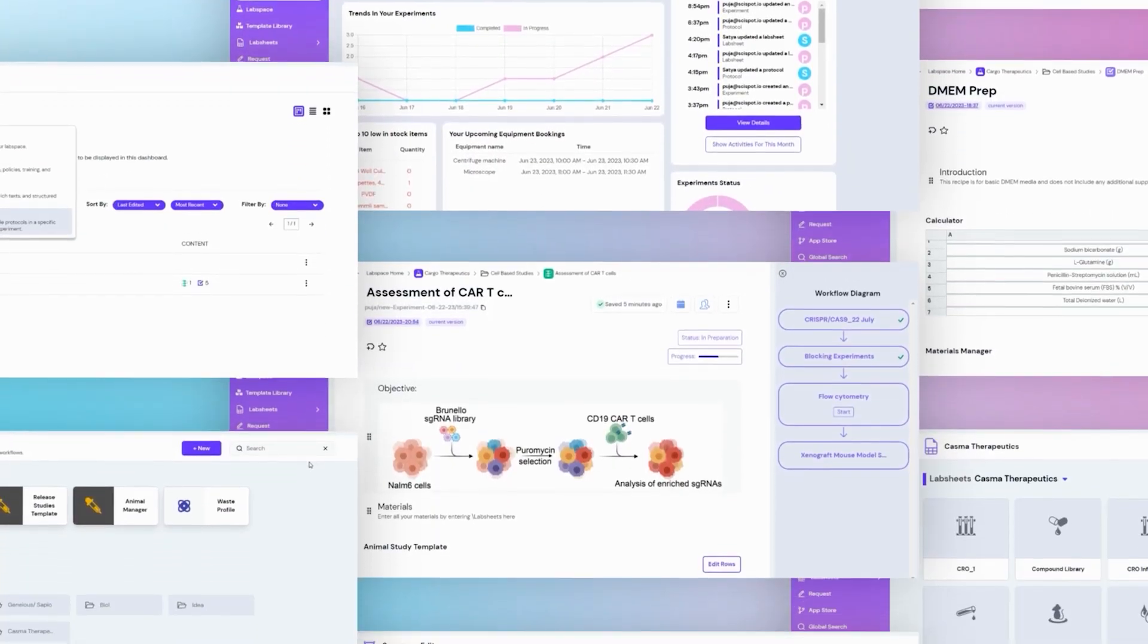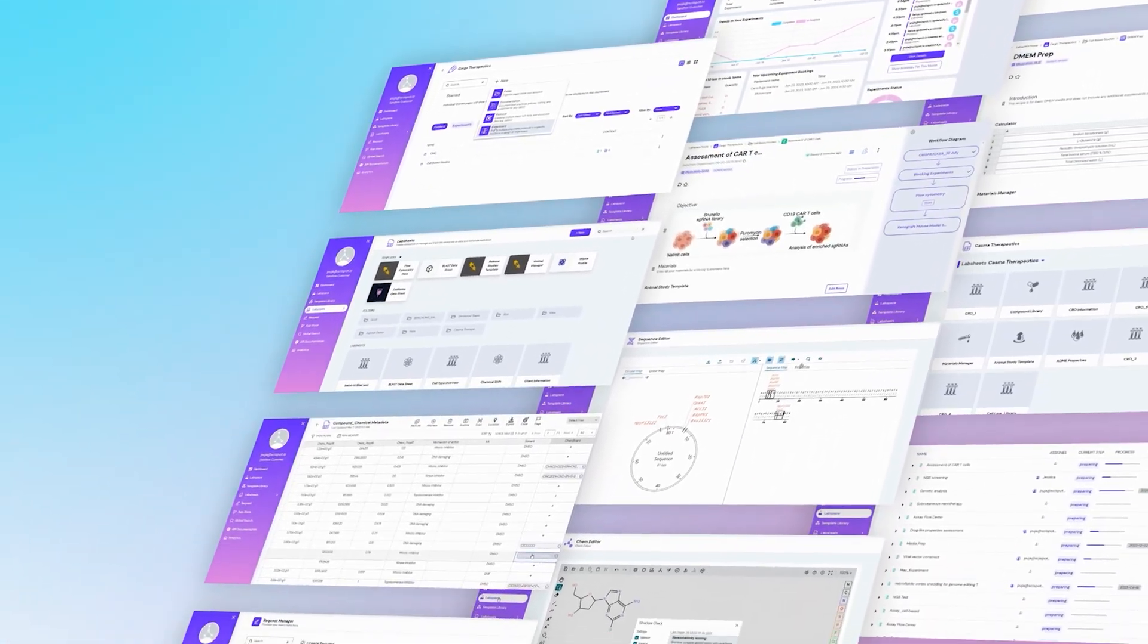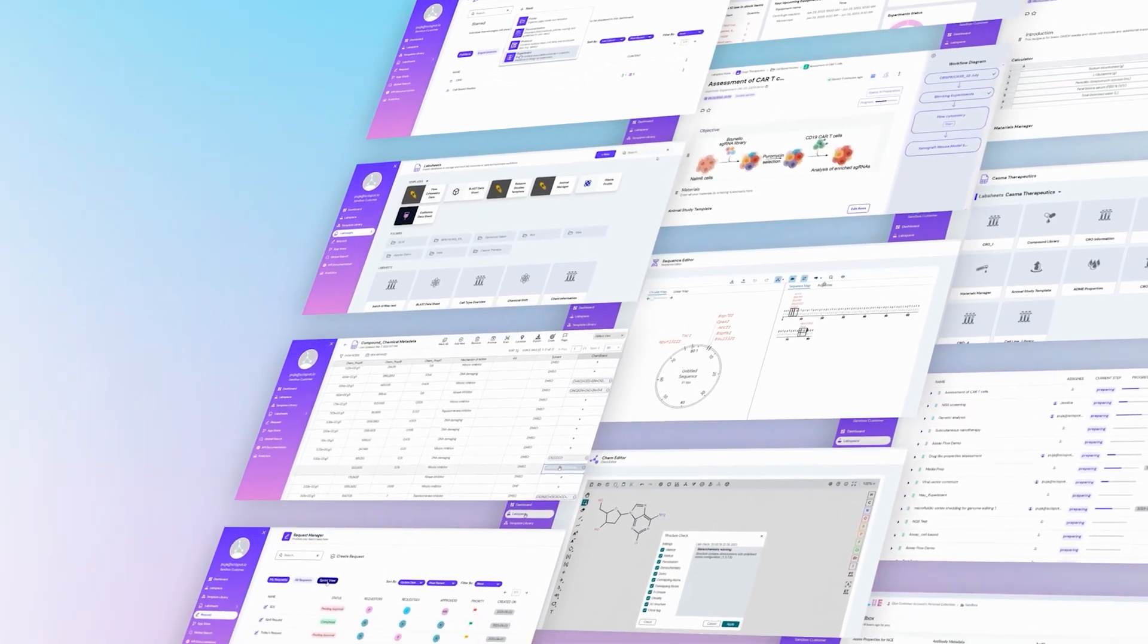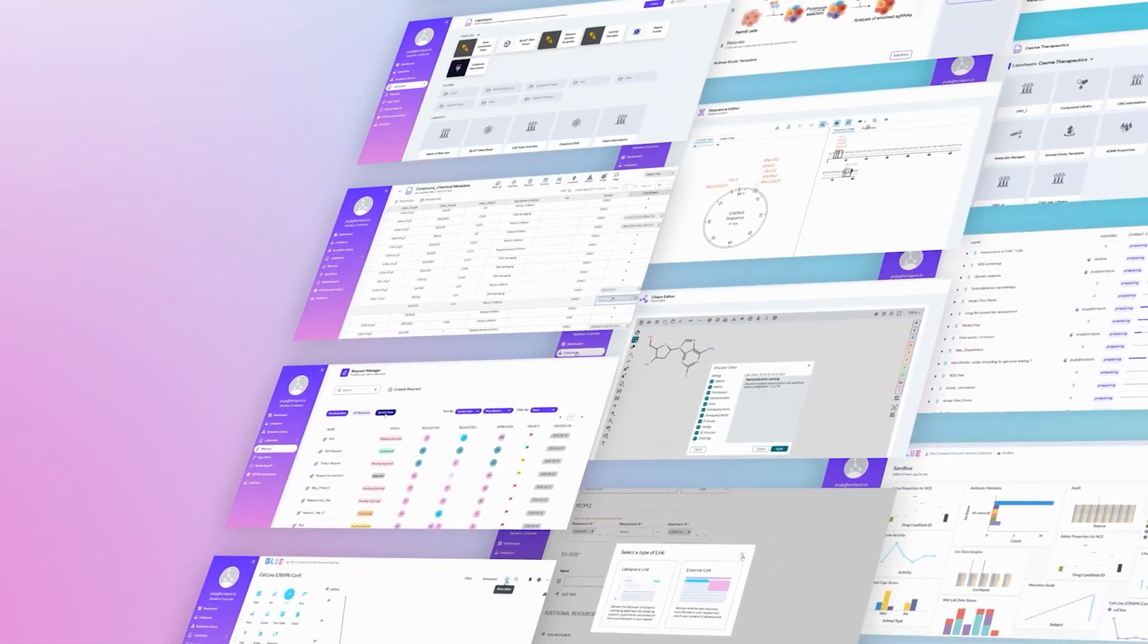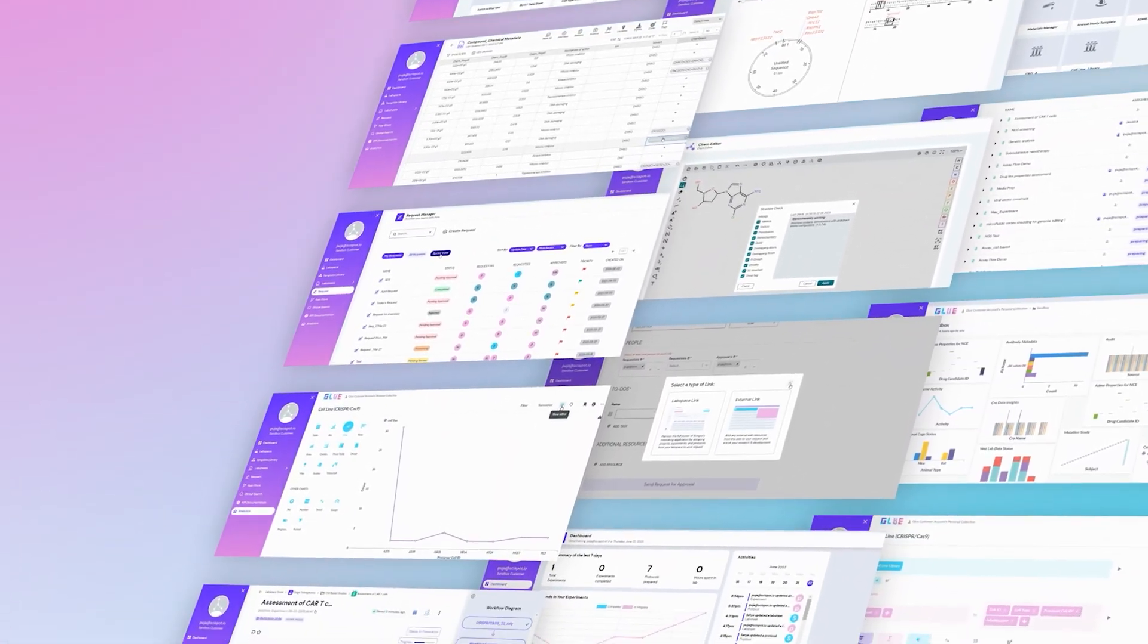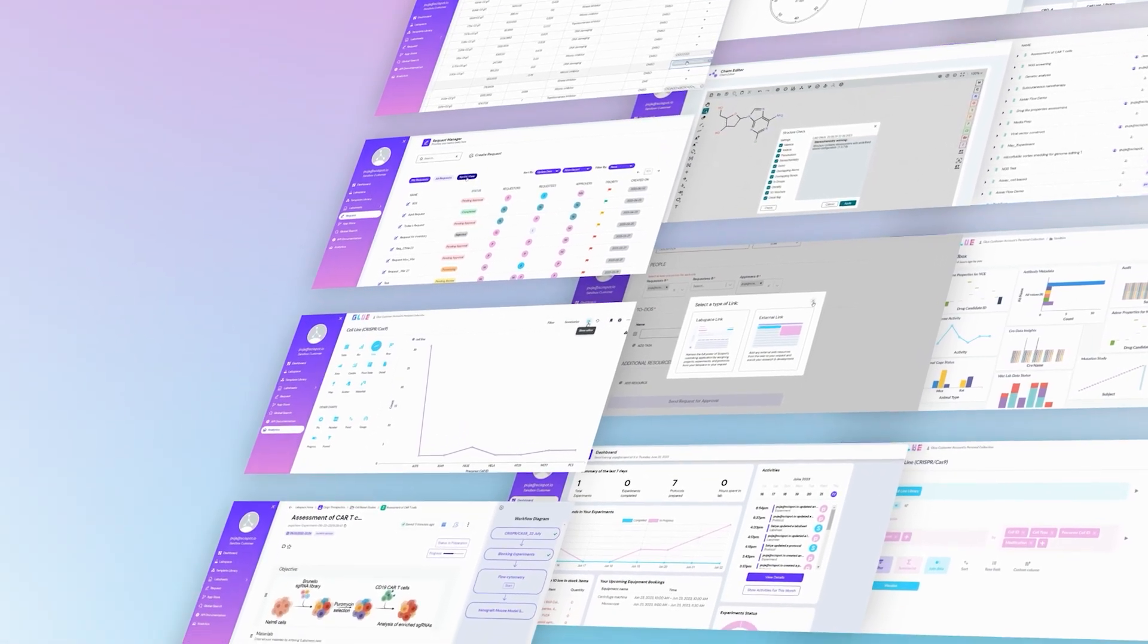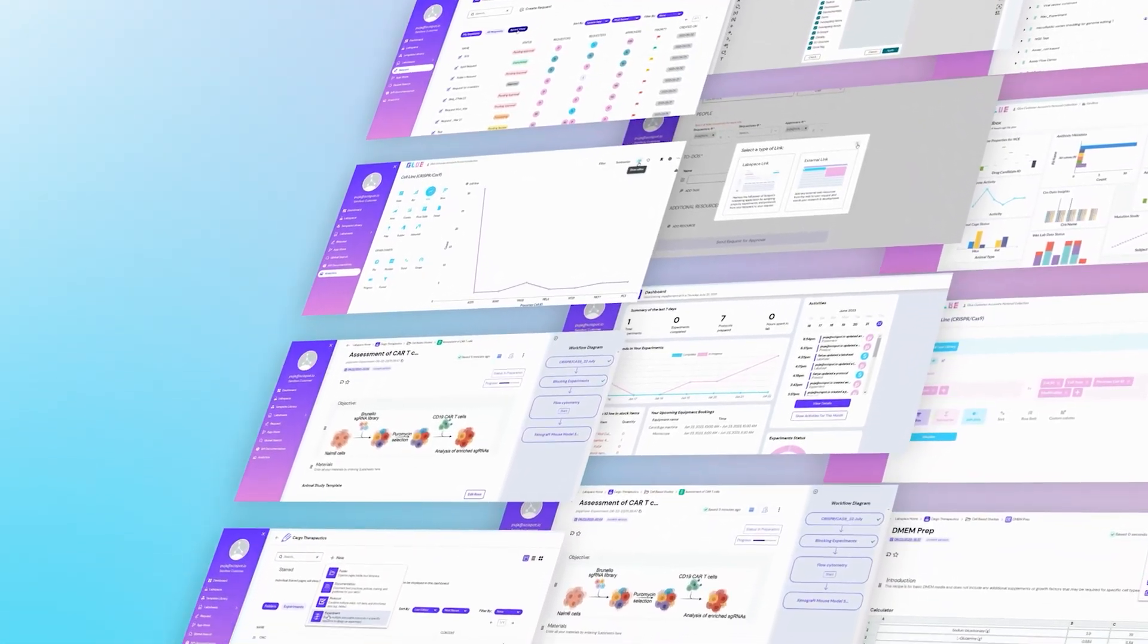The SciSpot platform offers a comprehensive suite of features designed to streamline data management, inventory control, and project collaboration. In this overview, we'll provide a brief description of the key functionalities of the platform.